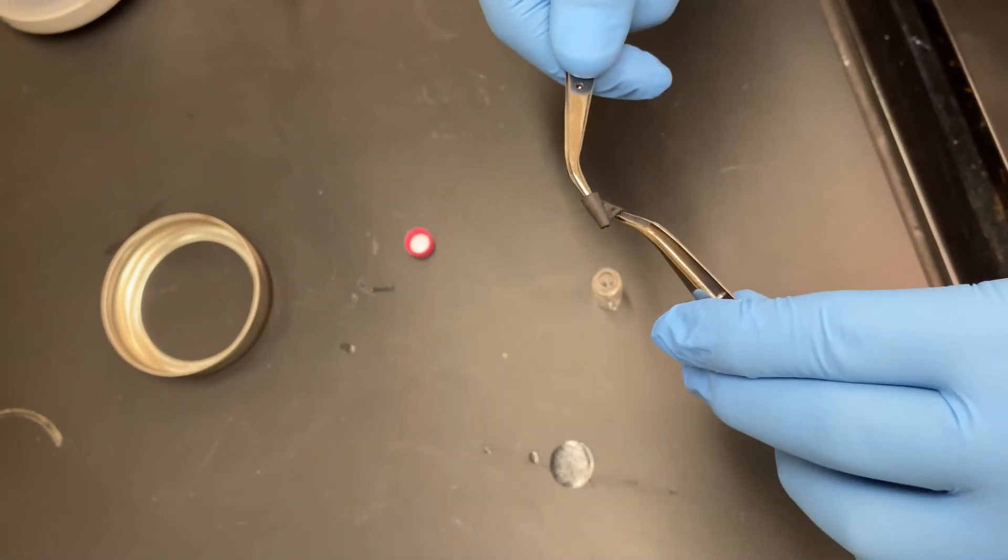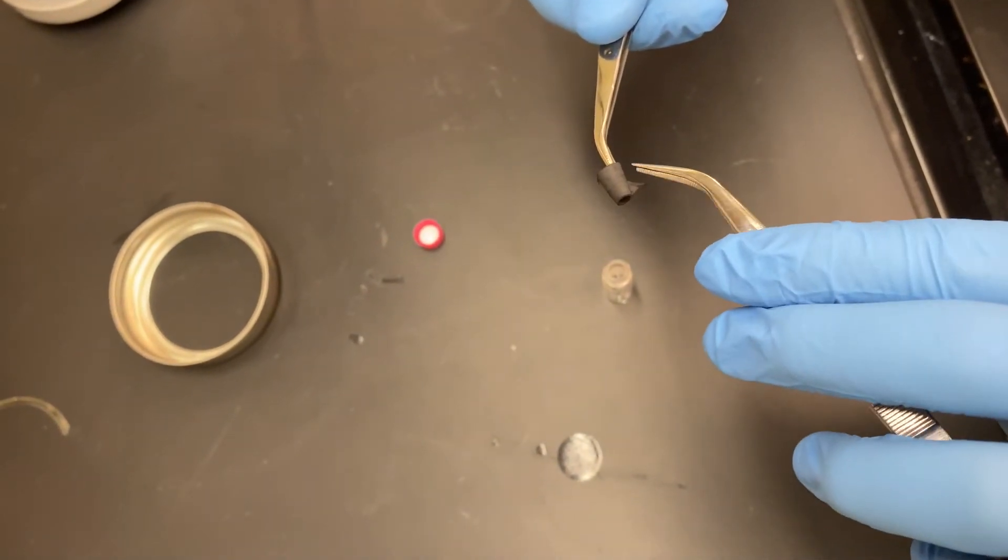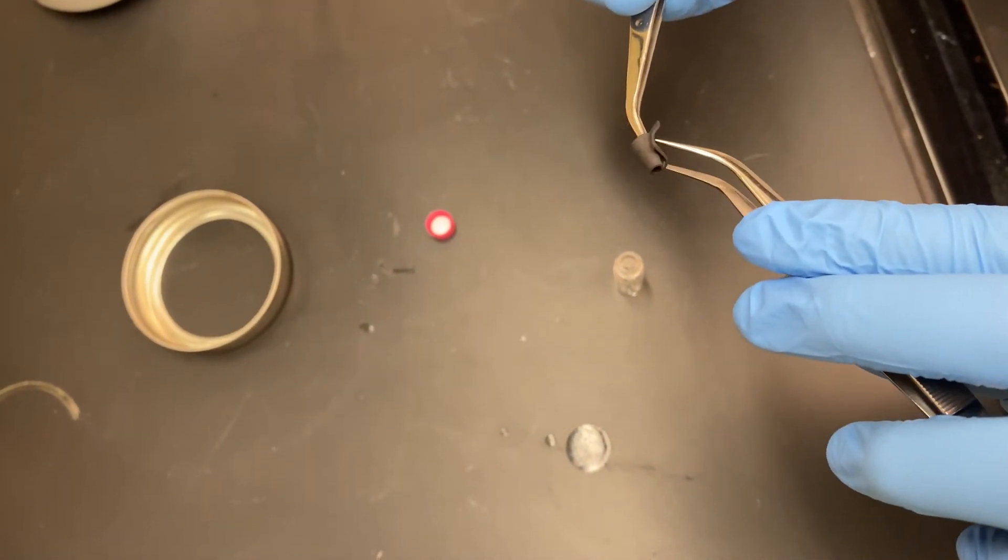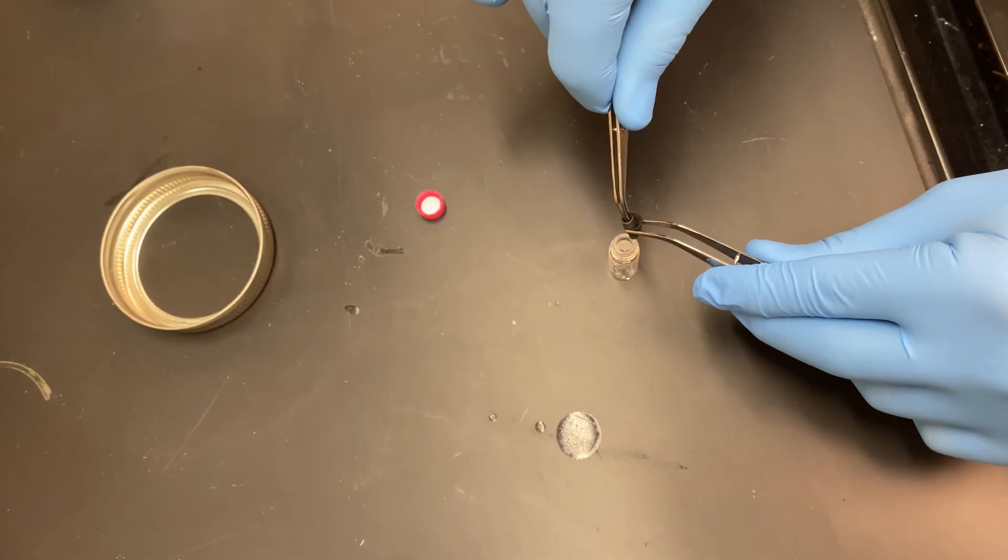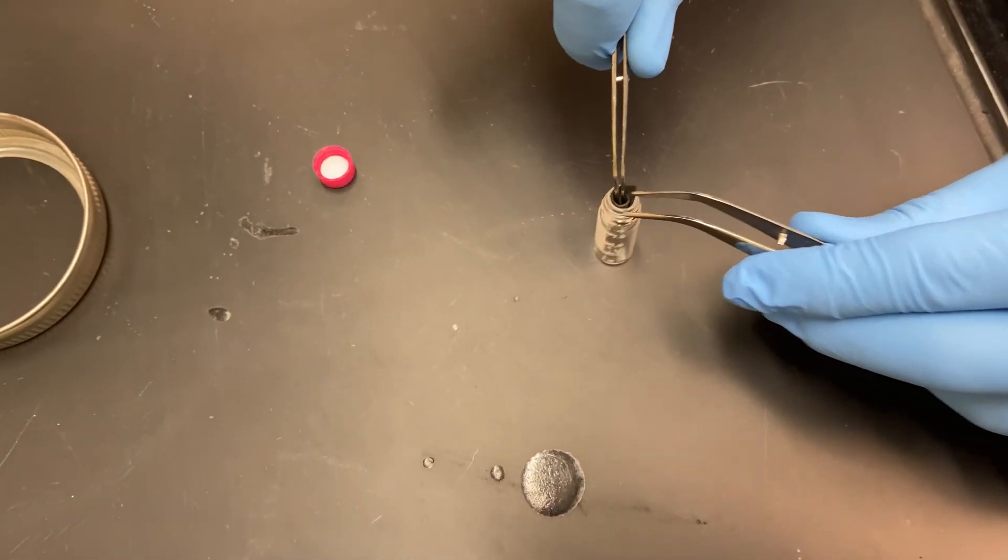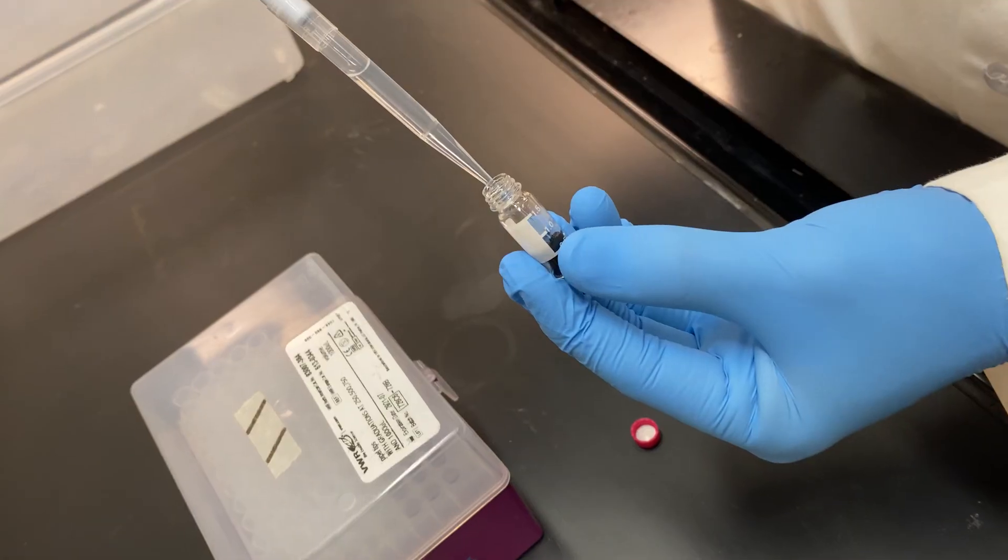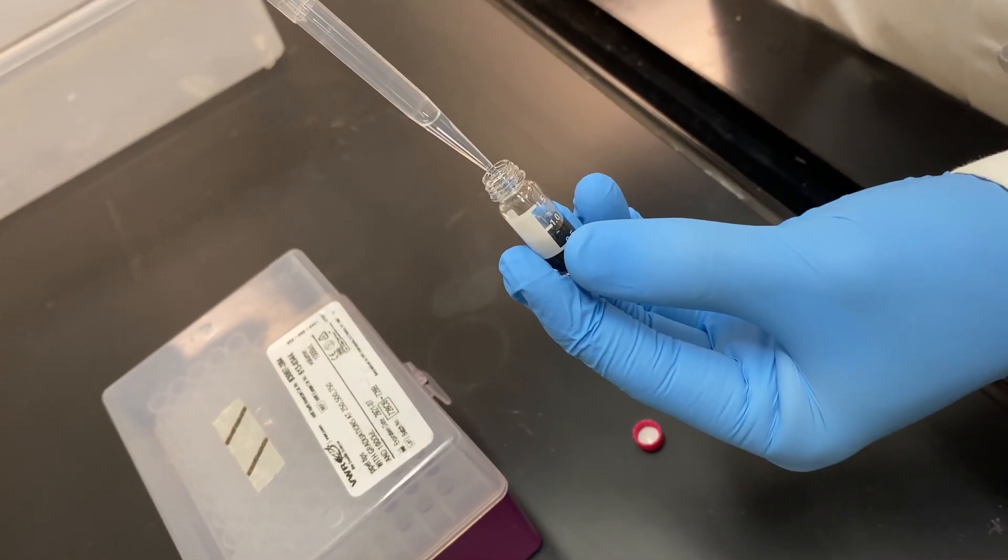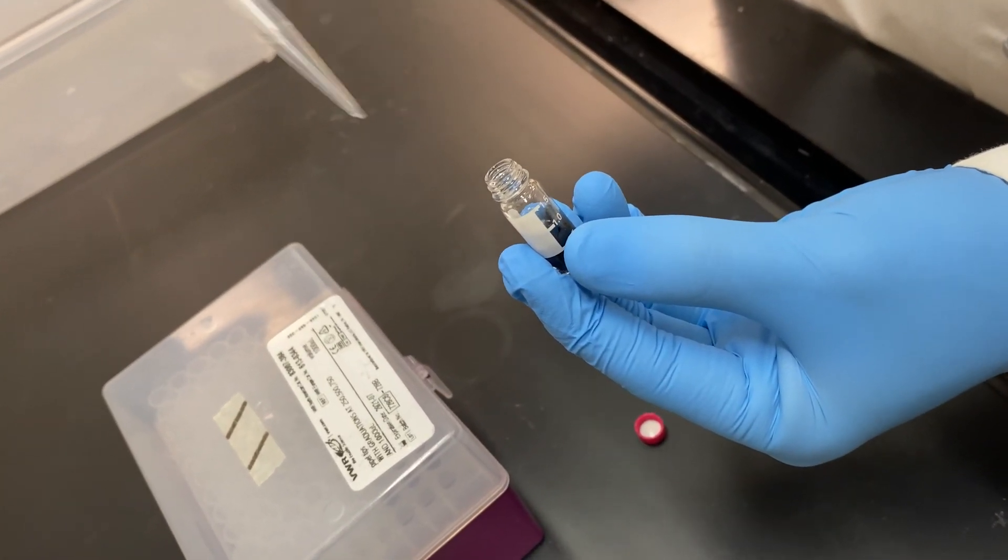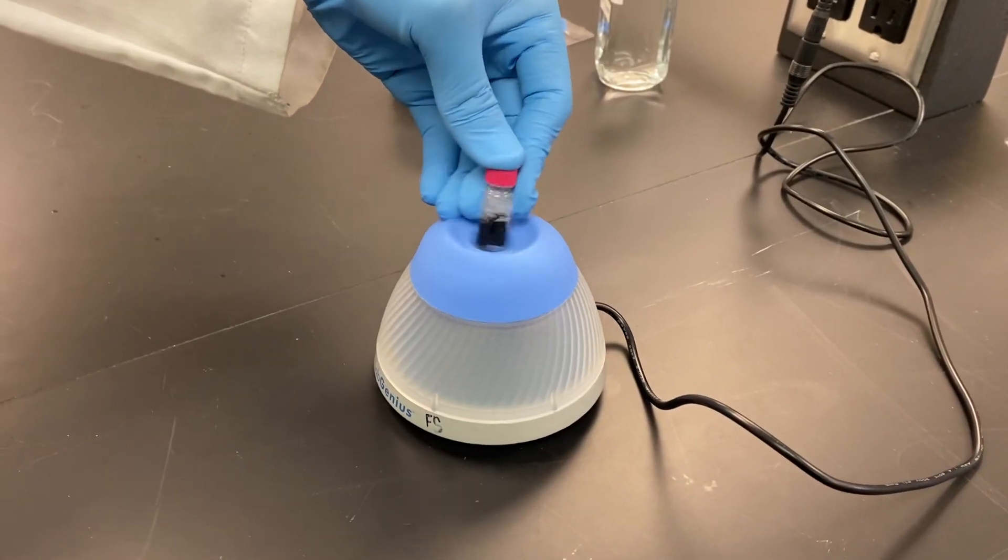Place the activated charcoal strip into a labeled 2 milliliter GC vial. You will need to curve or roll the strip in order to fit it into the vial. It's easier to use two tweezers to do so. Once the charcoal strip is in the vial, add 1.8 milliliters of dichloromethane and then vortex briefly.